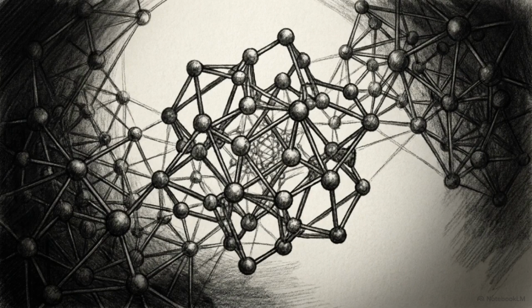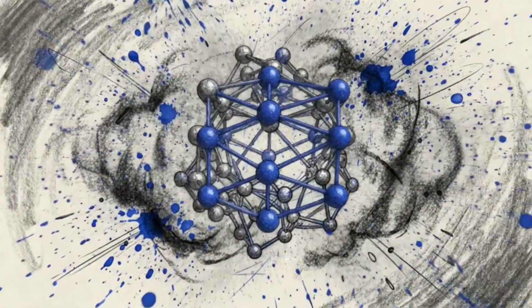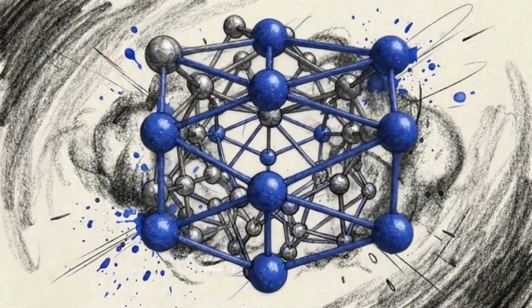A macromolecular refinement against high-resolution data is never finished, only abandoned. A solved protein structure is never a perfect reflection of nature. It is simply the exact boundary where our mathematics can no longer extract any more physical truth from the raw data.